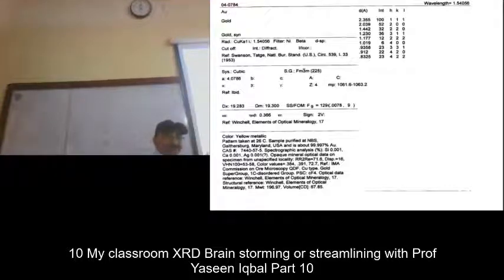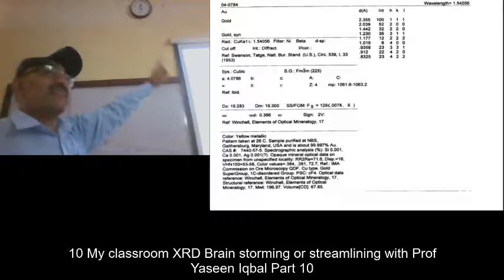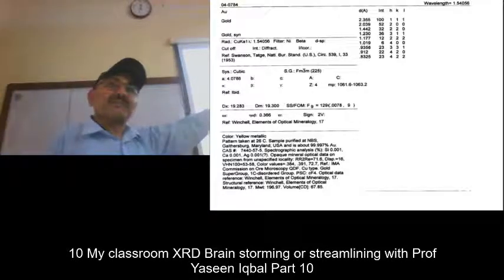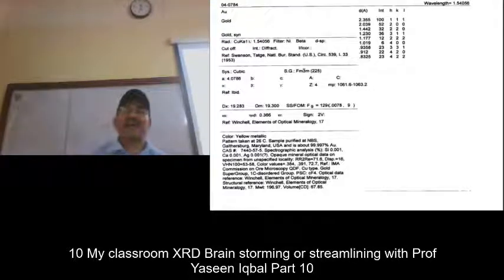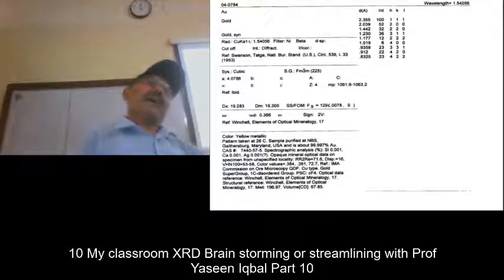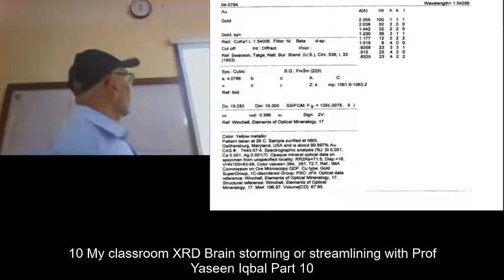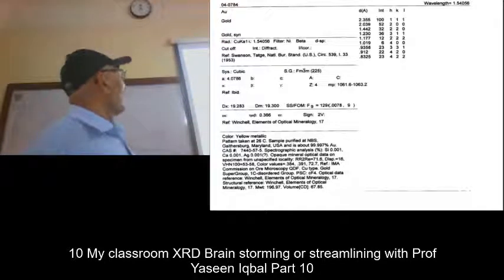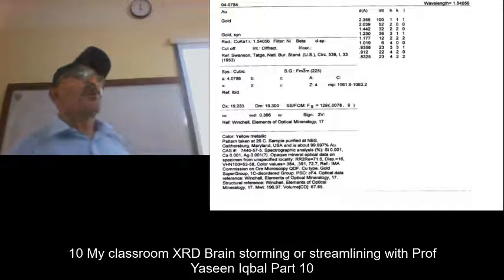They give the material, then there, look, d and intensity, this intensity is I over I naught. They haven't given exactly 150 or like that, but they divided by the maximum intensity, and 100% was the highest, and then the lower values came from there. hkl are there, and they have not given the 2 theta values, but they usually give 2 theta values as well.